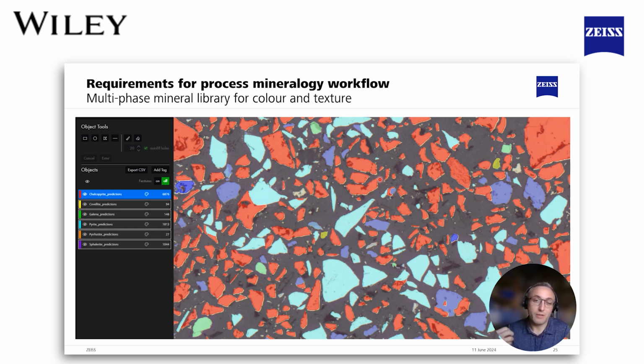So that might be the way that samples polish, the way that they pit. So things like galena, for example, with those triangular pits, that can all be incorporated into some of the features that this model is going to look for to say that that is galena, or the sort of slightly more pillowy texture of something like arsenopyrite, as well as the color variation. Those kind of internal textural variations are going to get taken into account. And that includes also the way that they fragment as they're crushed. So particular sizes and shapes of different grains are all going to get incorporated into that model. And this is enough information to start to neatly separate minerals, even when the colors themselves might be very similar to each other.